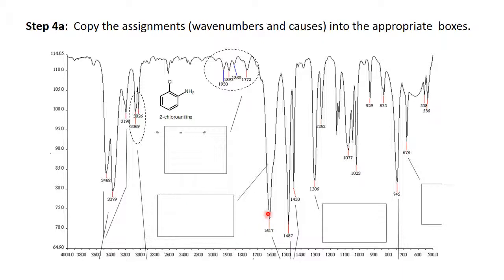Here is the NH in-plane bend, the scissoring at somewhere in the region of 1580 to 1650. It appears that one of the aromatic ring stretches, the 1600 band, is overlapping it here. At 1306 we can see the CN stretch which typically is between 1265 and 1340 in an aromatic amine. It's a fairly broad band so we can pick that out.